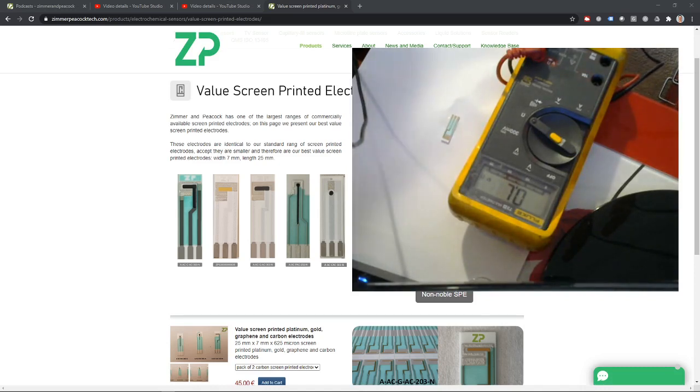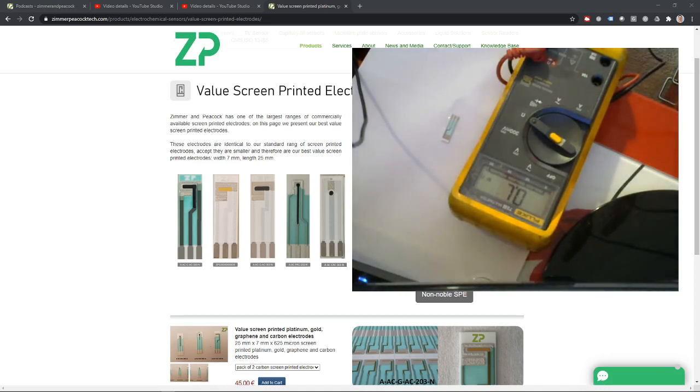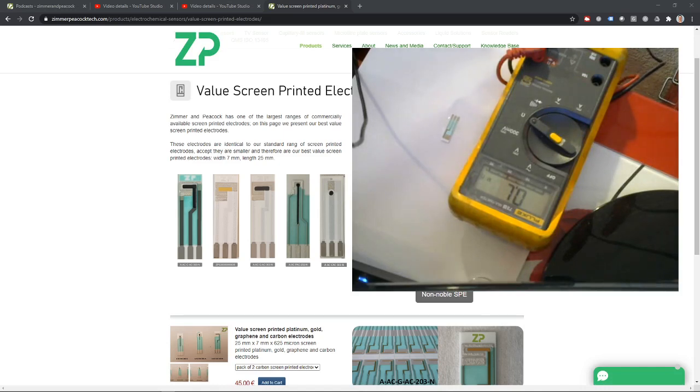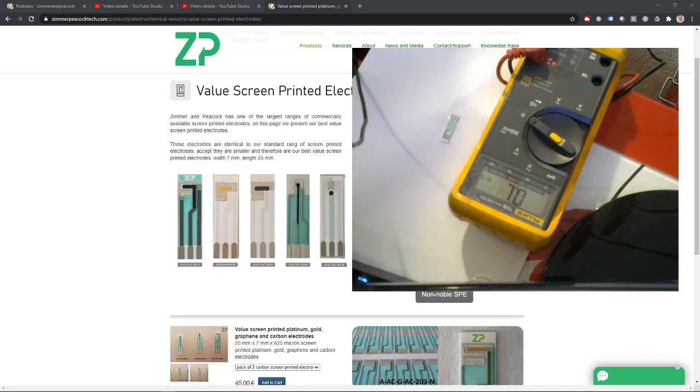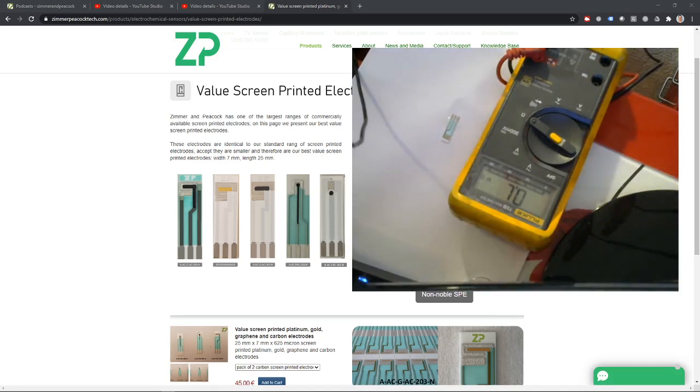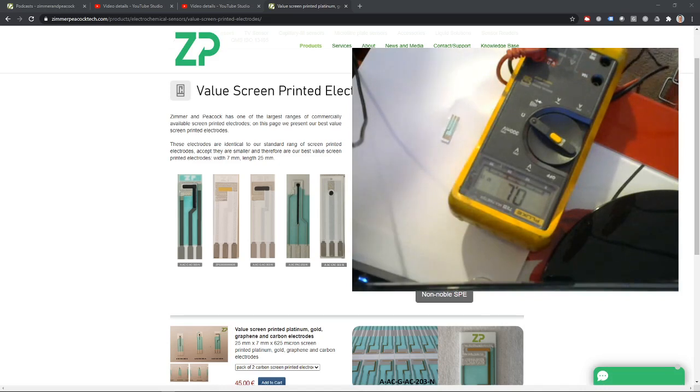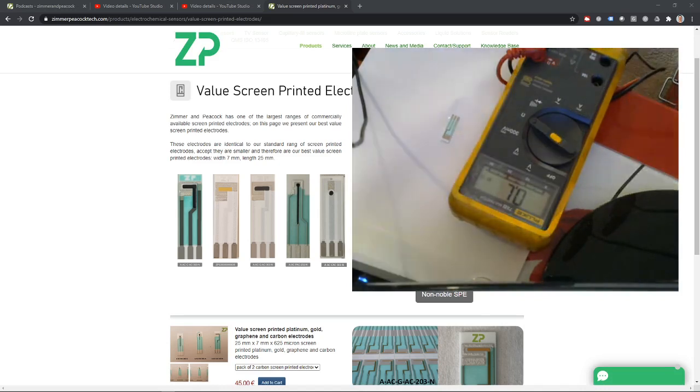So in summary, when people are making biosensors with gold electrodes, I recommend the 303. And if you're going to do it by impedance spectroscopy, then I've just done a quick measurement, and the resistance is sort of 1.1 ohms, 1.2 ohms, which is really sort of nothing. Okay, thanks very much.